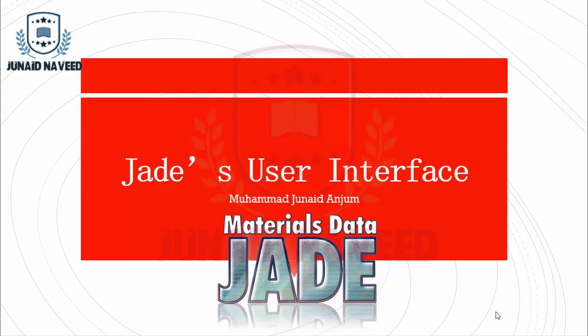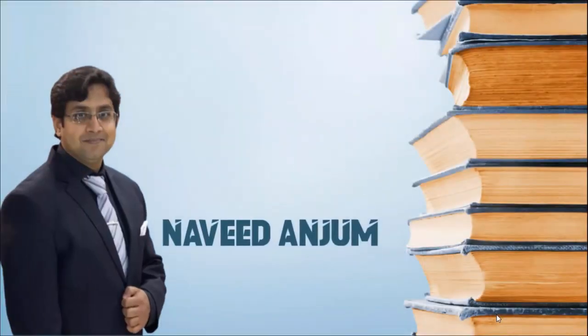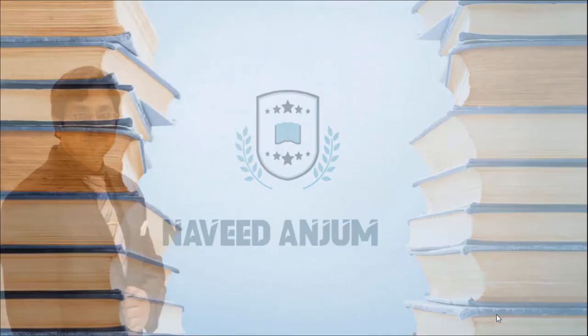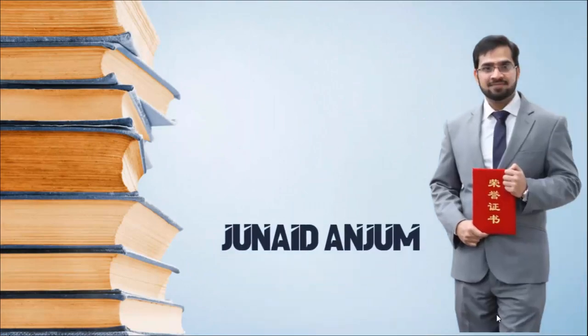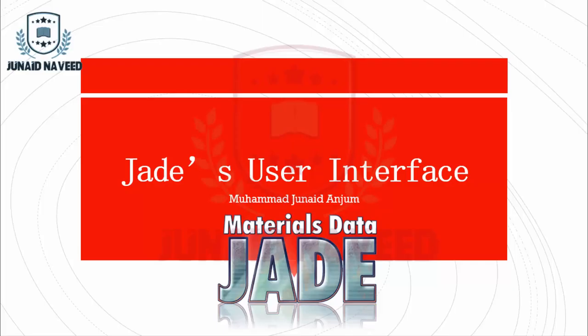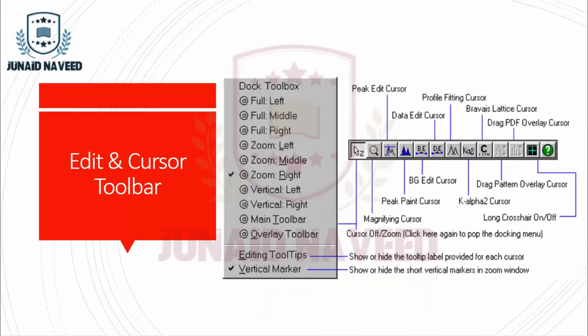Welcome to our YouTube channel Junaid Naveed. Today is the fifth video of Module 1: Shared User Interface. Today's topic is Data Cursors and Editing Tools, so let's begin.